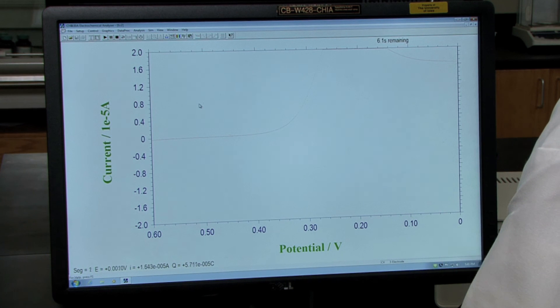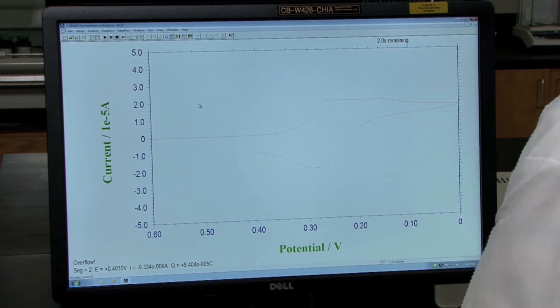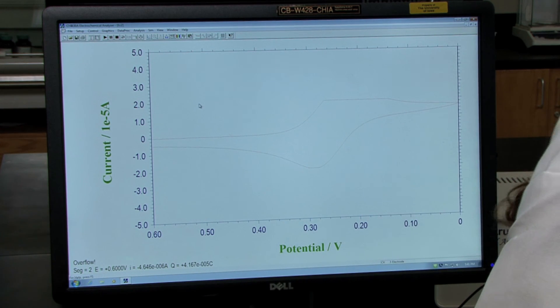Now this is not a typical CV graph. The results you get during the actual lab will look much different. This is just for demonstration purposes.